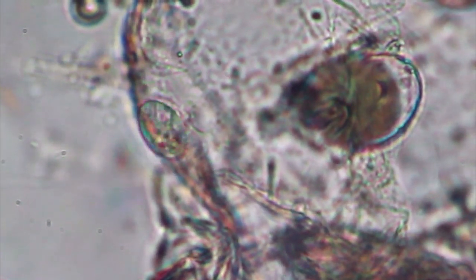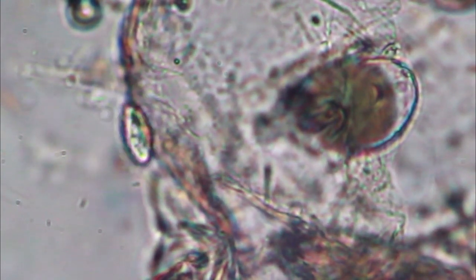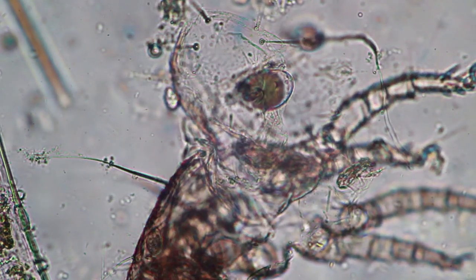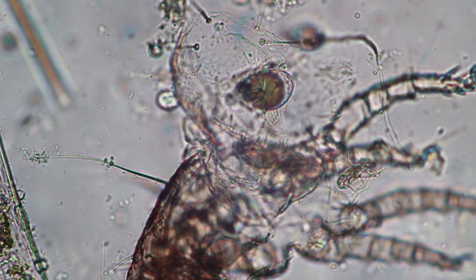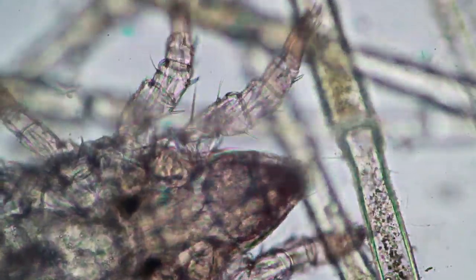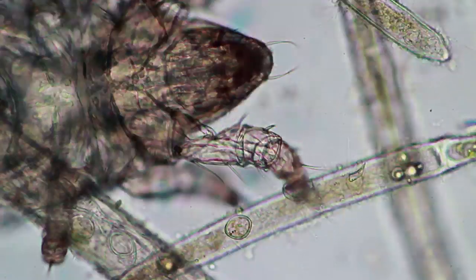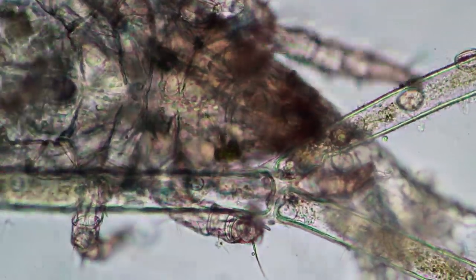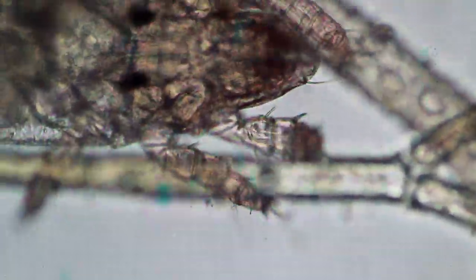If you look carefully there are two ciliates, probably feeding on the exoskeleton or whatever is left over here. The mites themselves hatch out of eggs and they have larvae as well. The larval stage only has six legs, so you have to be a little bit careful that you do not confuse mite larvae with insects, because insects of course also have six legs. And those little ciliates are moving around looking for food.